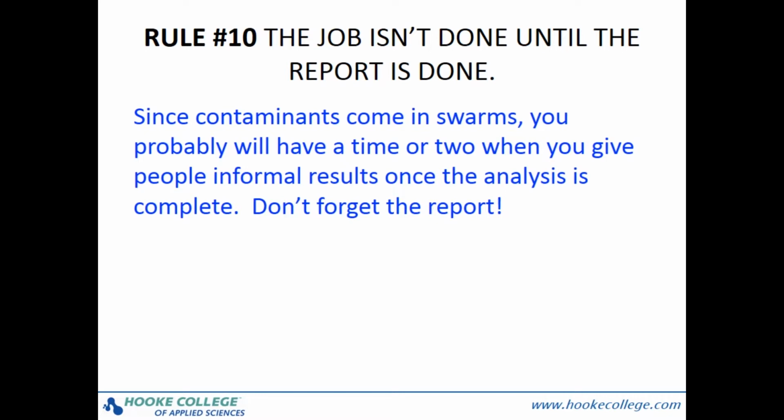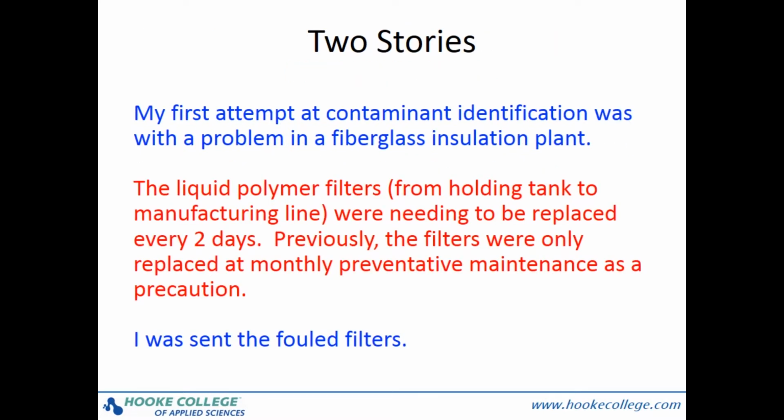Well, that's the end of the rules, but I do have a couple of stories. My first contaminant was an eye-opener. It should have been simple, since sample preparation was easy, as was particle sampling. The filters were sent to me. There were particles on the filter. They had been washed, so all I had to do was pick those up and put them onto the microscope.